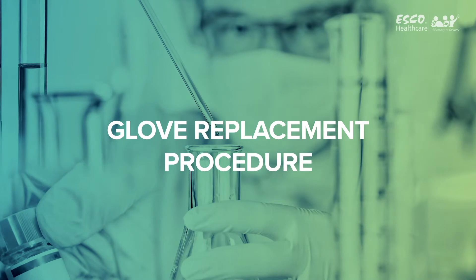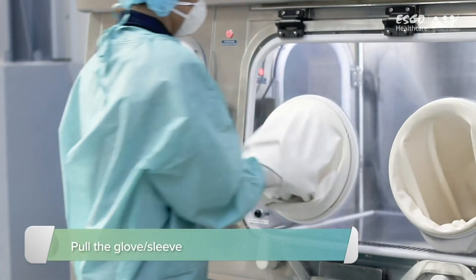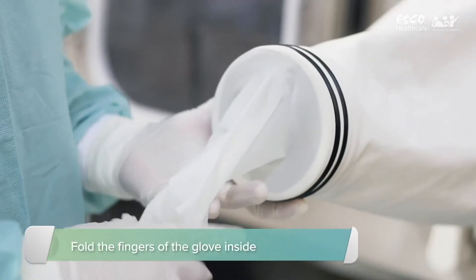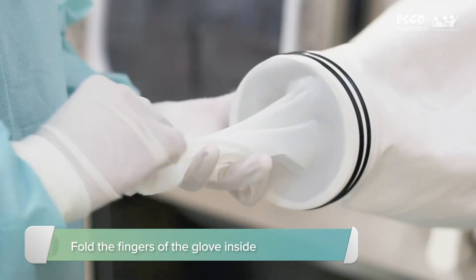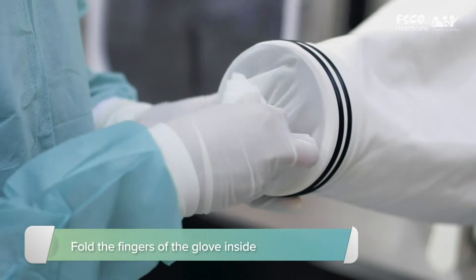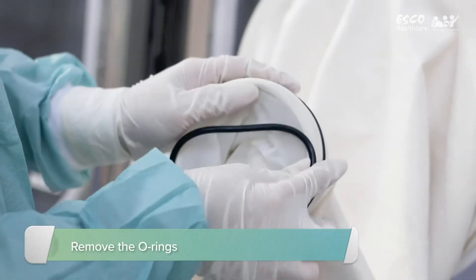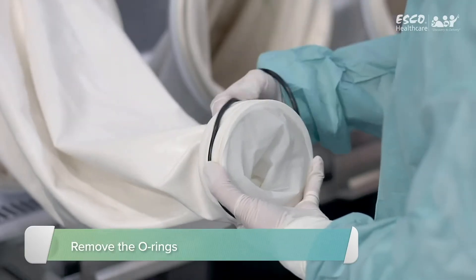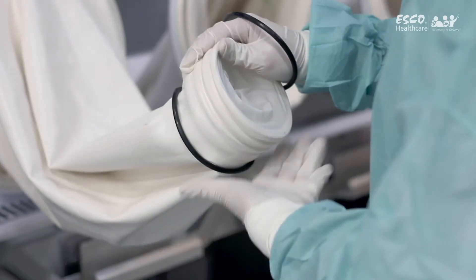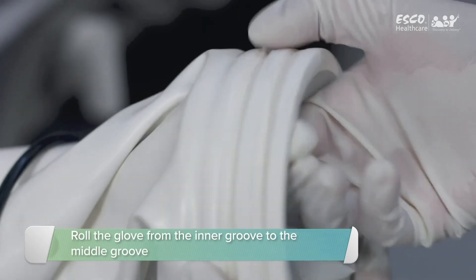Glove Replacement Procedure. Pull the glove and sleeve outside the isolator. Fold the fingers of the glove inside the cuff ring. Remove the O-rings. Carefully roll the glove from the inner groove to the middle groove.